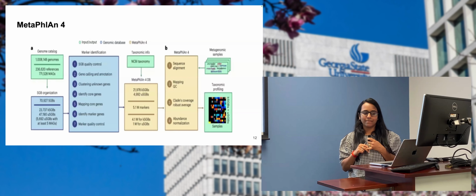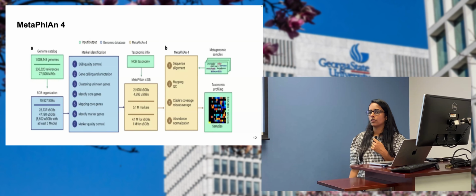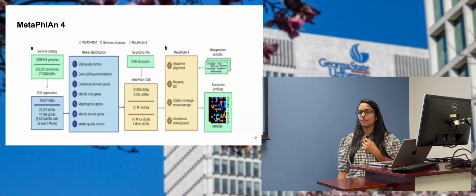That's why we use it: there is one portion of the genome specific to the species. If you find a lot of reads mapped to that region, it tells you that probably these reads come from that genome, because we have high similarity with that region.